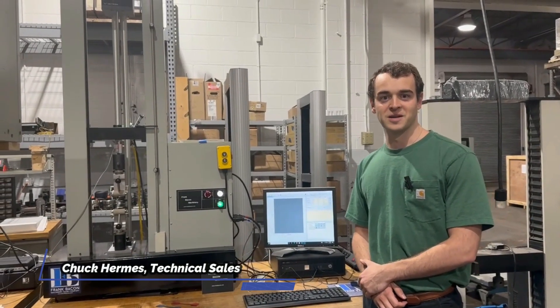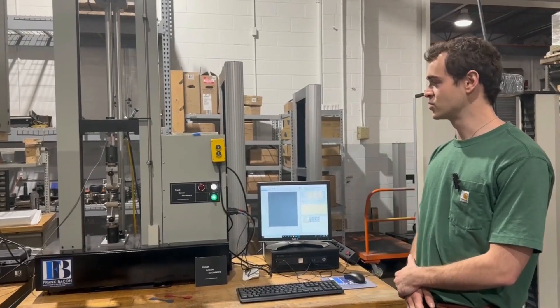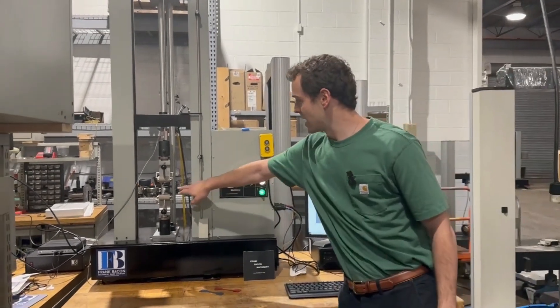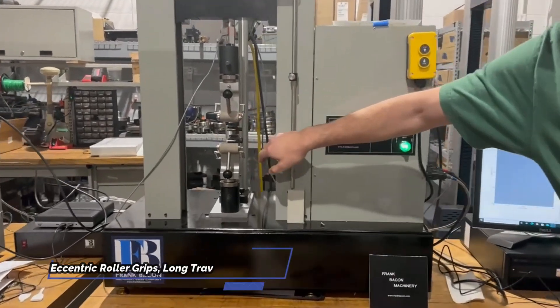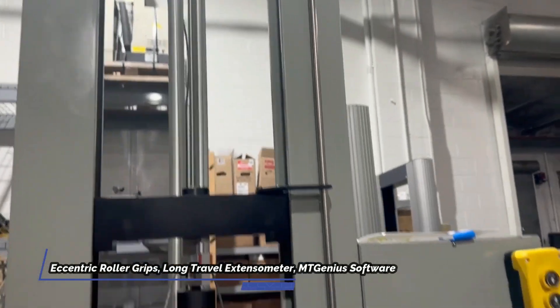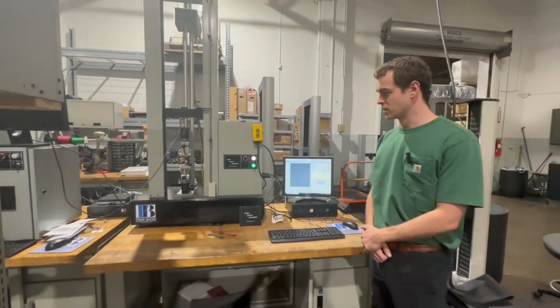Hey everyone, Chuck here with Frank Bacon Machinery, here to show you an ASTM D412 test. We've got an Instron Series 1000 that we built out for a customer. This is our custom job with a set of eccentric roller grips, a long travel extensometer, and of course MT Genius software and controller that we've turnkeyed for a customer.